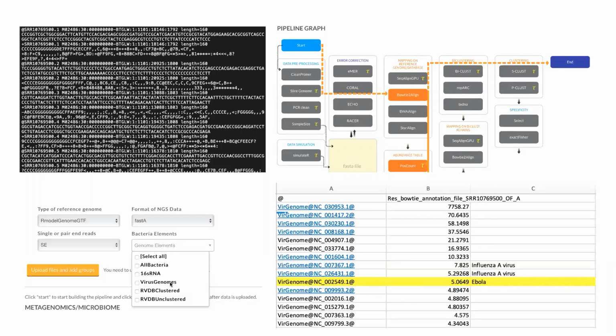So we have a database of different viral genomes from NCBI, and we just used Bowtie to align, which is a method of alignment of those reads onto that database. And then we also created an abundance table, and that is a script that allows us to calculate how many reads fall onto one of those genomic elements. So as we did that, we had an output.